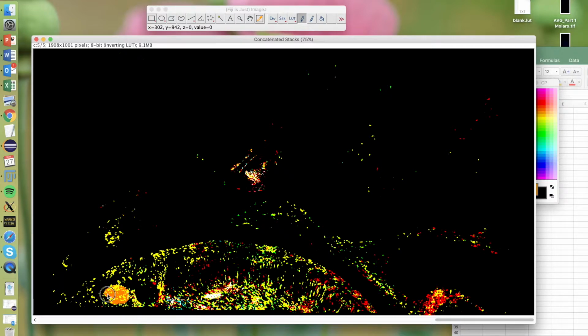And you can see the circular shape I'm trying to pick out. And we don't need to worry too much about the black space at the bottom. We can just include that. It doesn't matter too much. Don't need to be neat on that. It's more about the boundaries between the structures that you need to worry about.